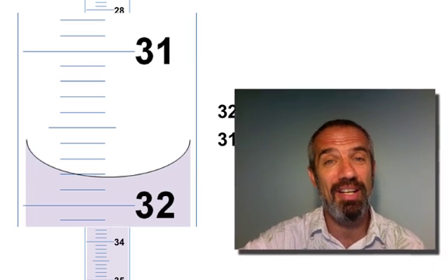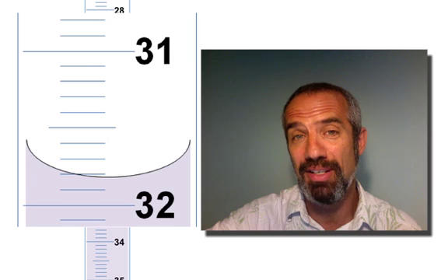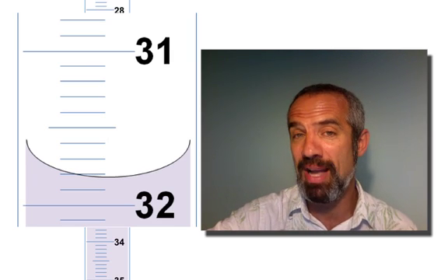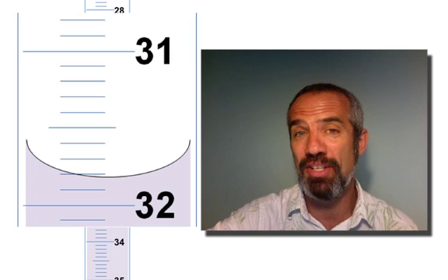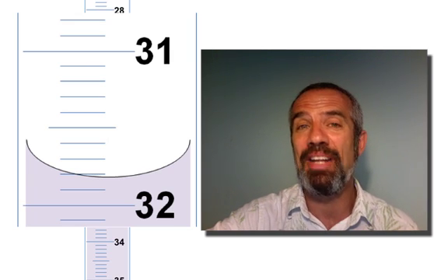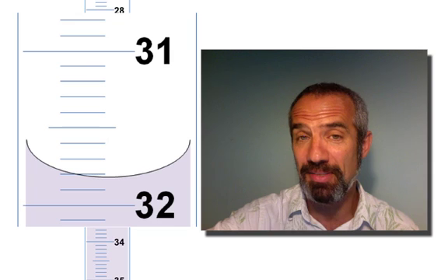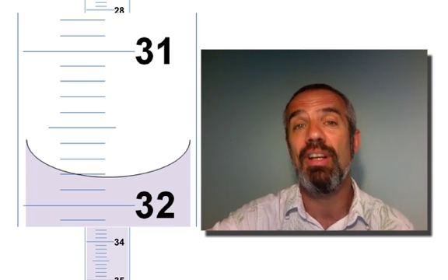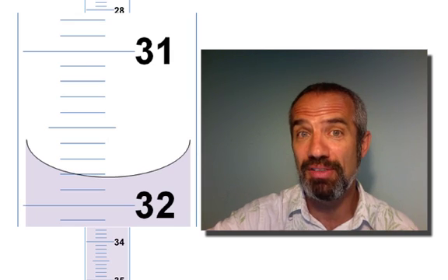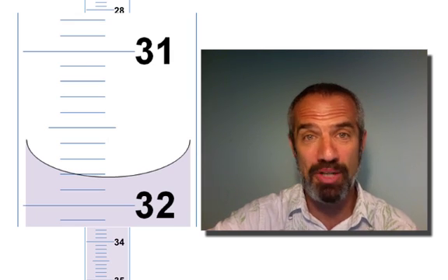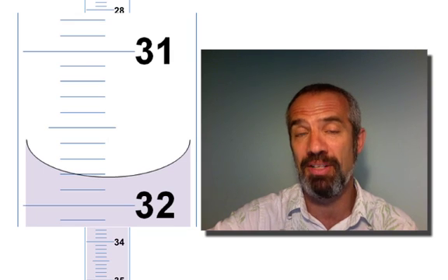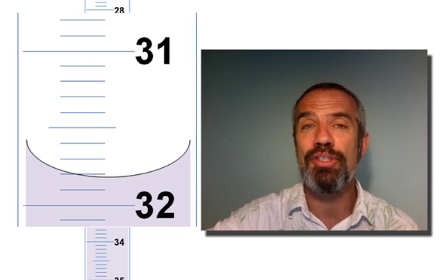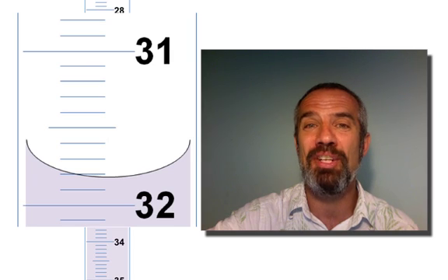So this has been our lesson in how to use a graduated cylinder. Don't forget to put that black screen behind it; it accentuates the meniscus better. And don't forget to read from the bottom of the meniscus. And that's in addition to the other two rules we learned: don't forget to include units. All these have been in milliliters. Most of our volume measuring equipment in the lab are in milliliters.